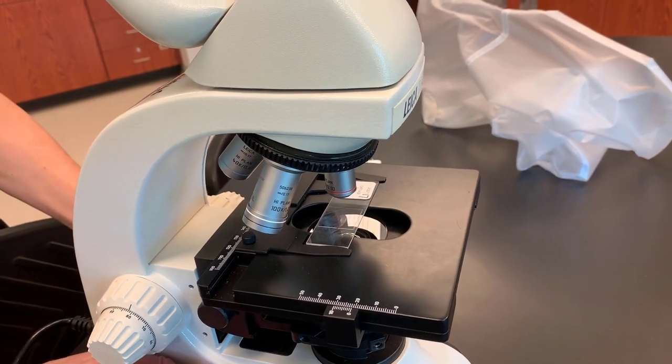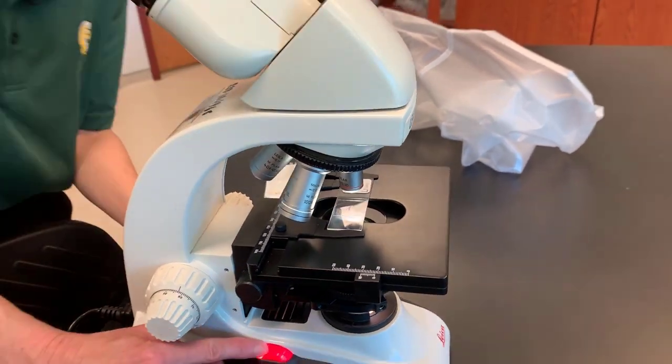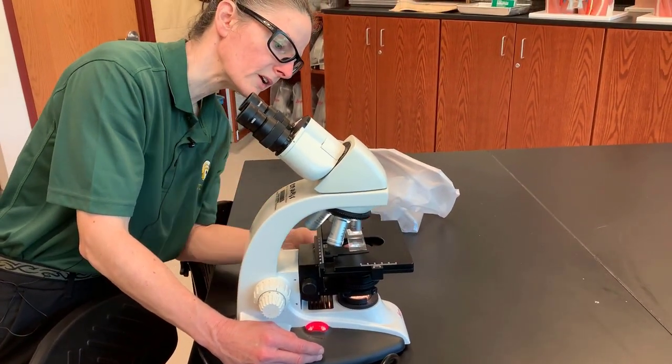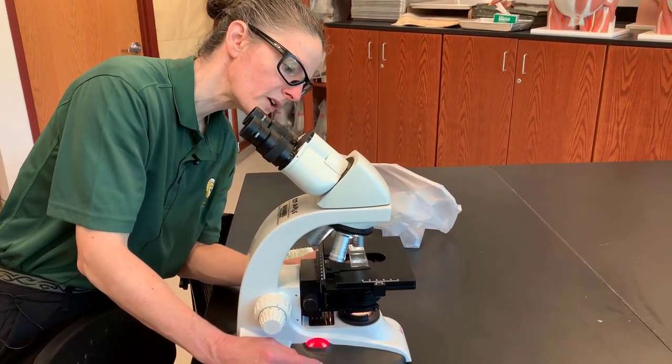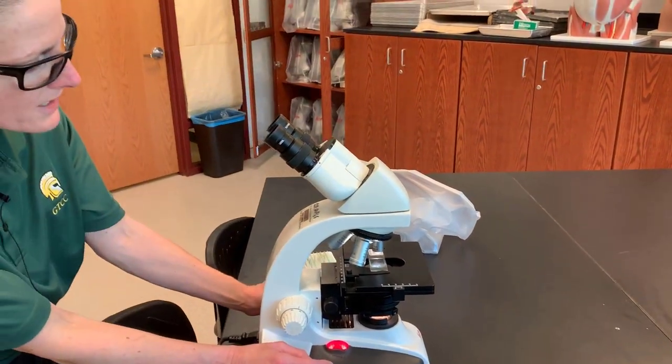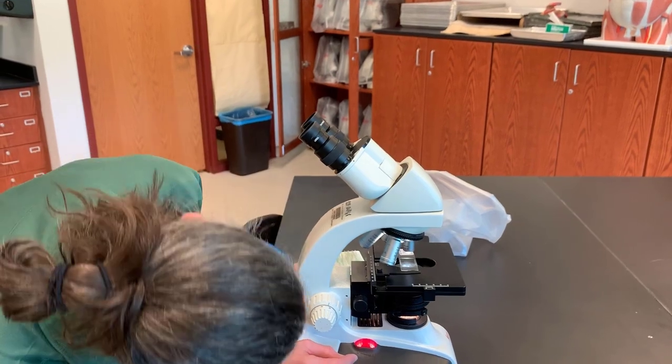This is what allows you to put the slide where you can actually see it. If you look at the slide, you can see there's a specimen on it, and you want to put the specimen over the light. Once you can do that, then you know you have a pretty good idea that you'll be looking at your subject.